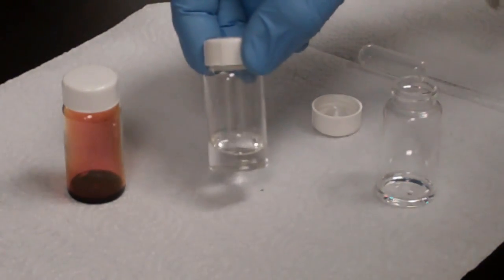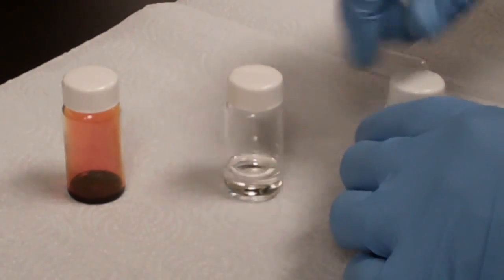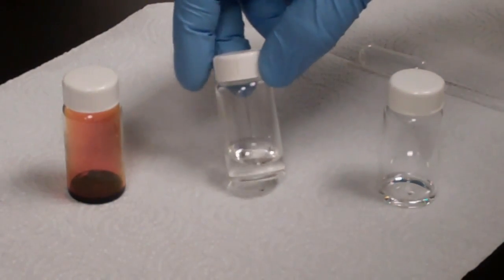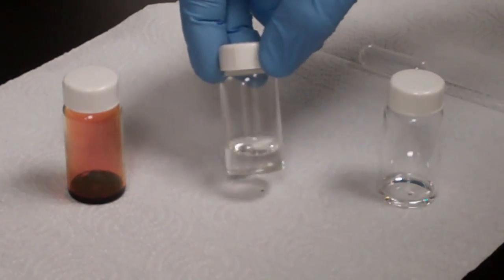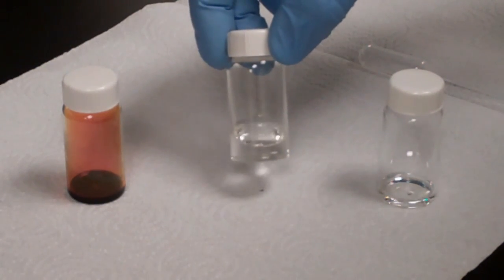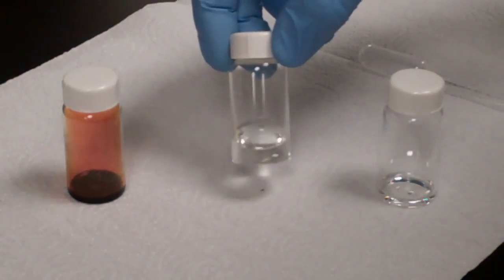So that's what you're going to see in the bromine test. You will see the starting dilute solution of bromine. I think what you all will be using in the lab is about a 2% solution, so it'll even be less intensely colored than what I was showing you for the purposes of the camera. But when you add your couple of drops of your alkene solution to the bromine solution, if you have an alkene, you should see the rapid disappearance of that color.